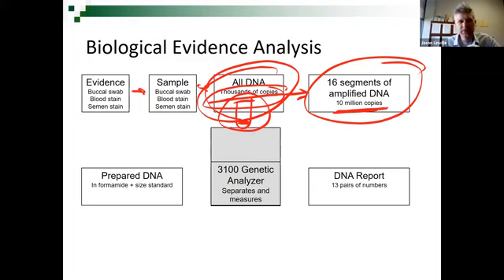We're probably not in the millions of copies. We've got to be a little bit above the hundreds of copies in order to get this to work. So thousands of copies is sort of the ballpark of where we're at. So we want to go over how we take those thousands of copies of DNA, thousands of cells, essentially. We busted them open, and now we have thousands of copies of our DNA.